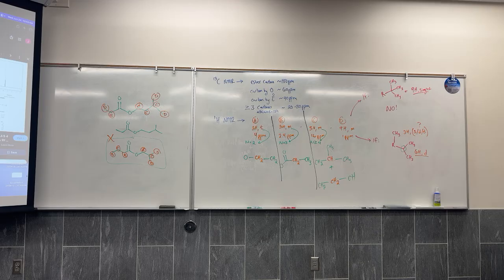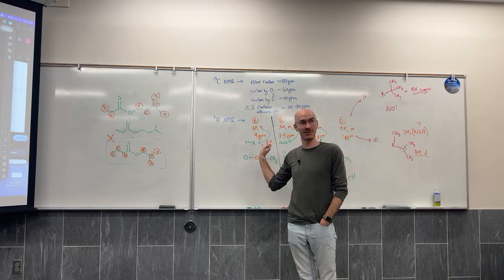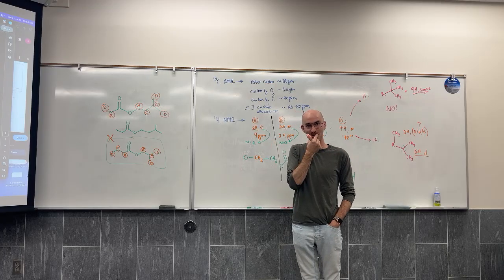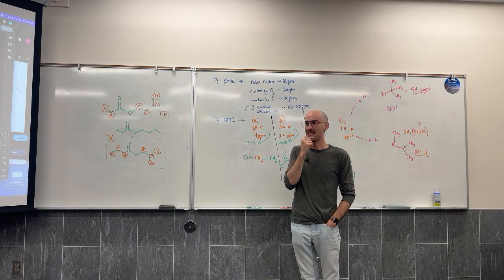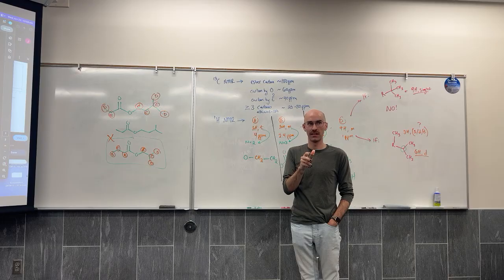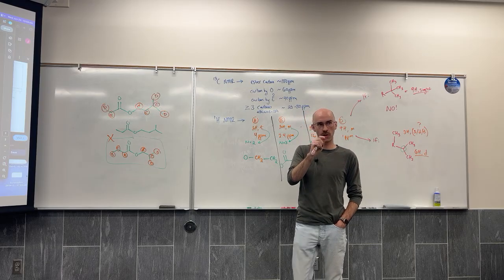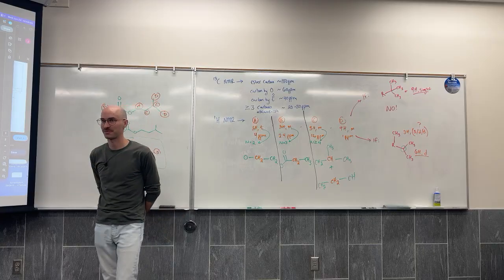What questions can I answer? What was the biggest challenge in doing this? It's all just so confusing. My integration was wrong. That was the biggest challenge. Right, I felt like I got it, but the 2H was in the wrong spot. Yep. I realized it was. So if the integration hadn't been wrong, that process would have gone a little bit more smoothly. But can you talk more, Gavin, about what about the whole process was so confusing?